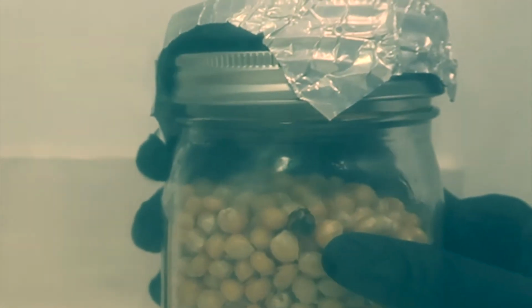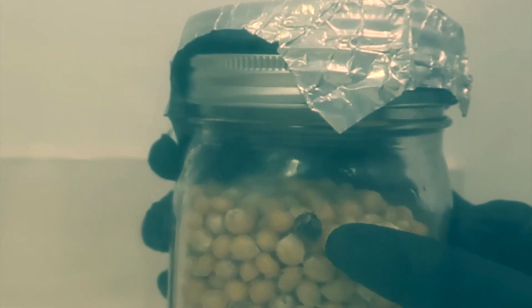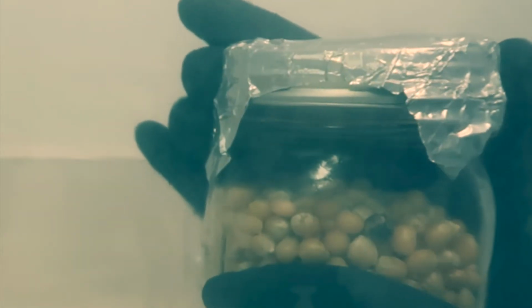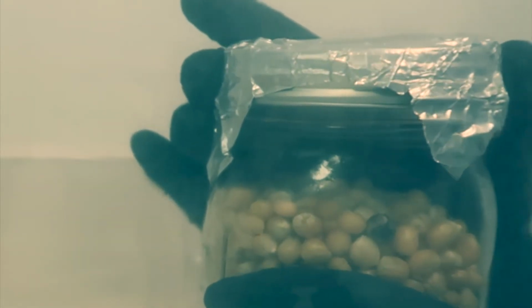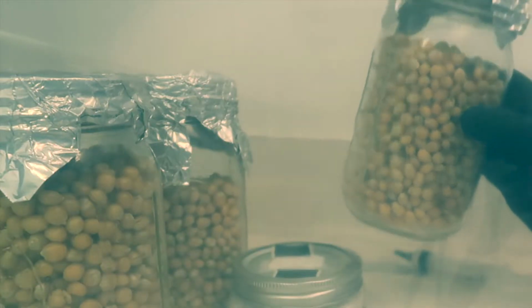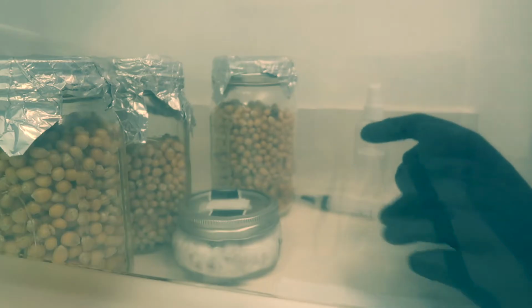Don't worry about these dark grains, those are just some of the burnt grains from when we were first hydrating the popcorn. Now I will loosen the lid just a little bit past finger tight, and leave my dust cover on there, and we're good to go. That one's finished. Next I'll work on the grain-to-grain transfer.